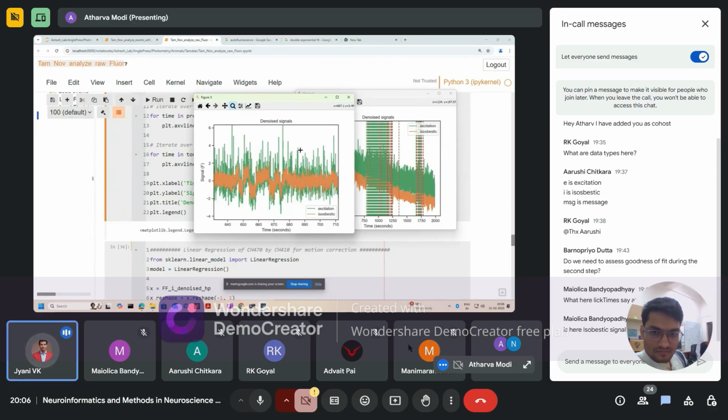Well, the signal shows very high growth or increase or decrease compared to the average, and plus you can do a standard deviation of all the trials. So what I'm saying is if there is just too much change in the signal, that particular thing can be removed. No, but that might be some artifact, we have to use the control signal. So what you are saying is remove too much changes and all.